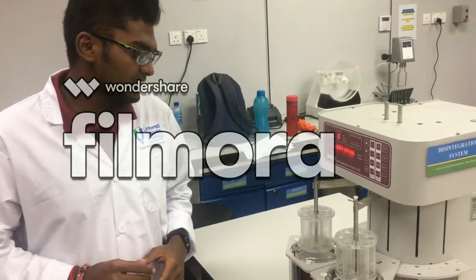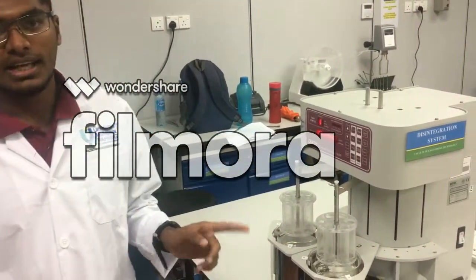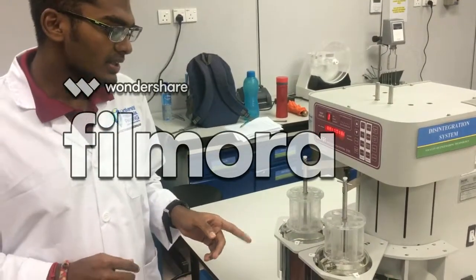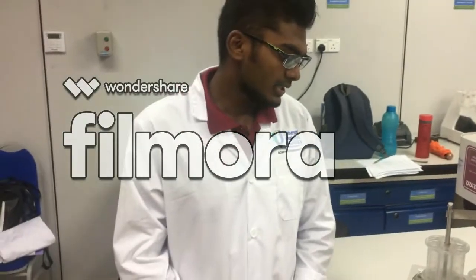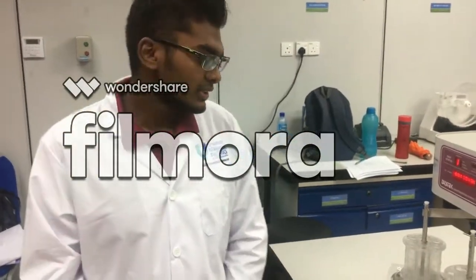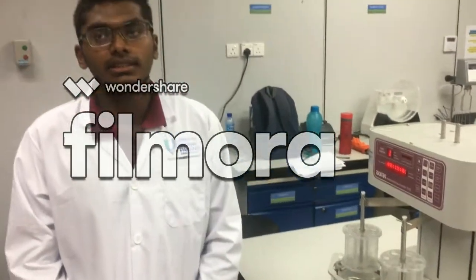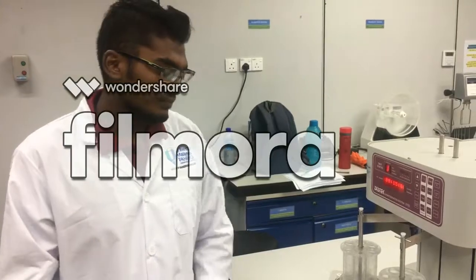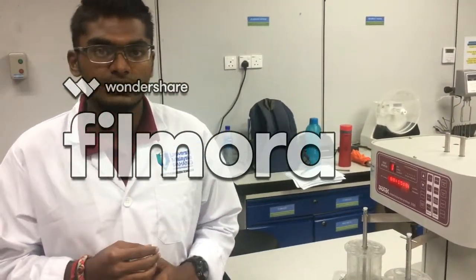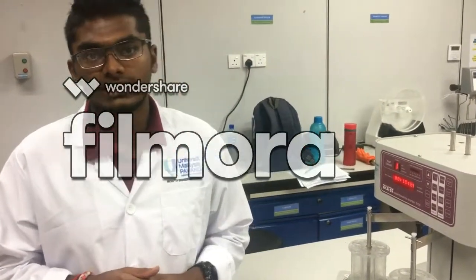This is the final result that we have obtained. Okay, this one is uncoated, and this one is the effervescent tablet after we have done the disintegration test. So what we have discussed from here: as we know, according to the theory, the assumed time for an uncoated tablet to disintegrate is less than 15 minutes, while for an effervescent tablet it is less than 3 minutes.